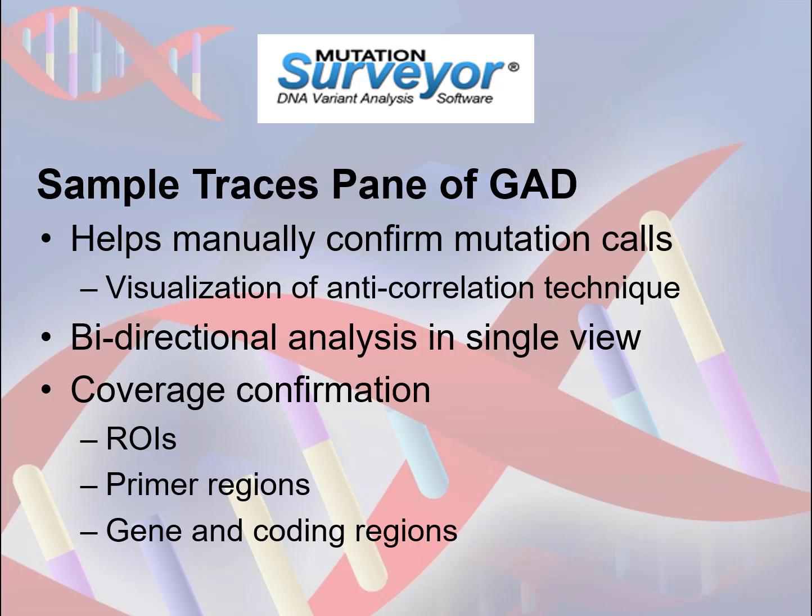The pane can also be used to confirm proper amplicon coverage by displaying regional information such as primers, ROIs, CDS, and gene. Let's take a closer look.